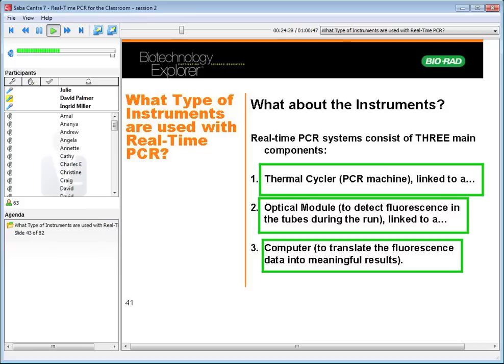And this is one I run in my class, and I really like doing this one. The ultimate result of this kit can potentially be a table that you can come up with for different food samples, and what you'll get is the amount of genetically modified food in each food sample. Because real-time PCR goes back to the quantity of DNA, you can calculate all the ratios of different things and get those answers. So this is a good kit for more advanced users. I wouldn't recommend it as a first time because of the big variability in the food samples that you've got.